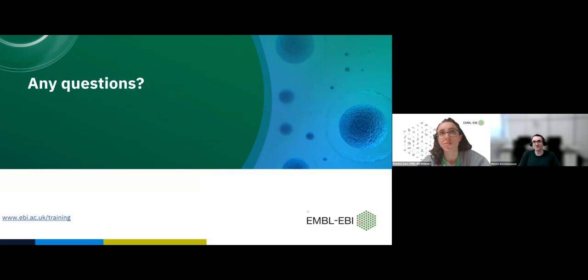They are not storing the data set there. The way it works is you host the data yourself and you then give a URL to the Vitessce application, and there the data is read from your own storage. The thing is, of course, it means that it has to be publicly readable.